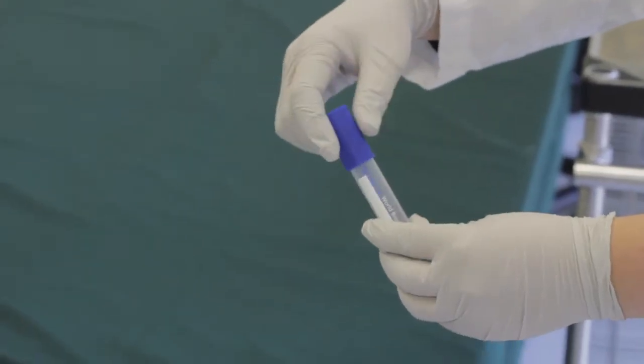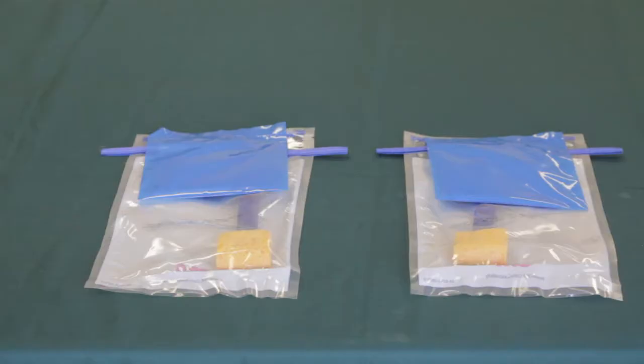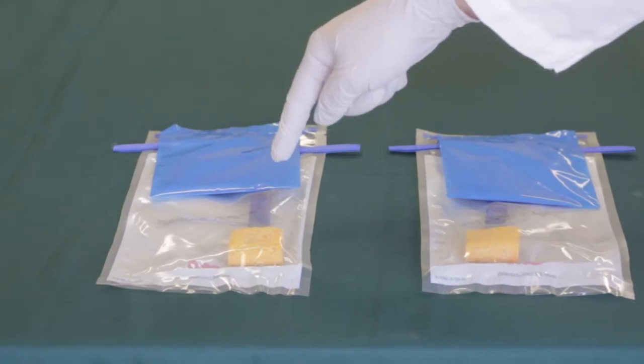If testing for listeria and salmonella from the same area, swab using two separate sponges.